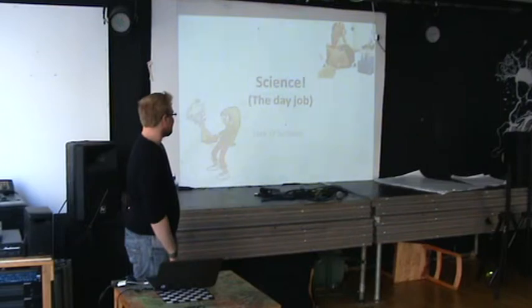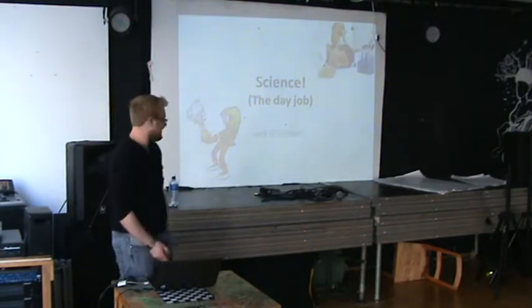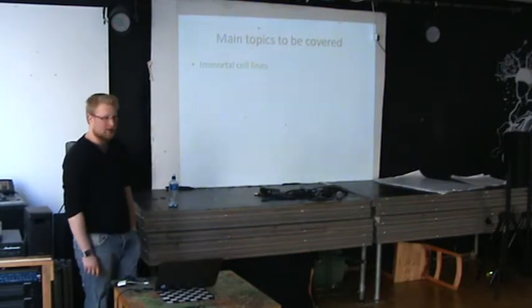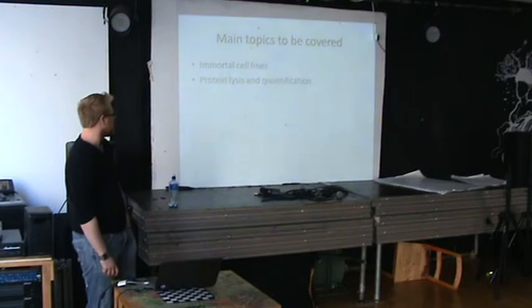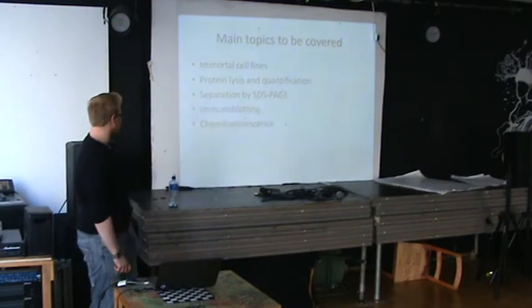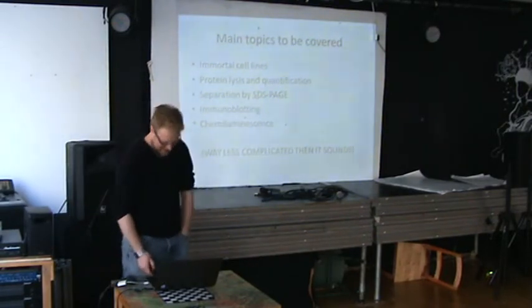I thought these two images kind of summed it up for me. Exciting, and oh dear God, what am I doing? So the main topics I'm going to cover are immortal cell lines, protein lysis and quantification, separation by SDS-PAGE, immunoblotting, and chemiluminescence, and it's way less complicated than it sounds.